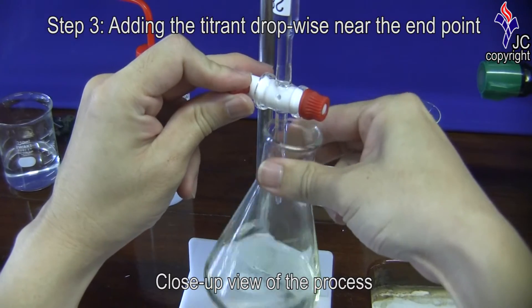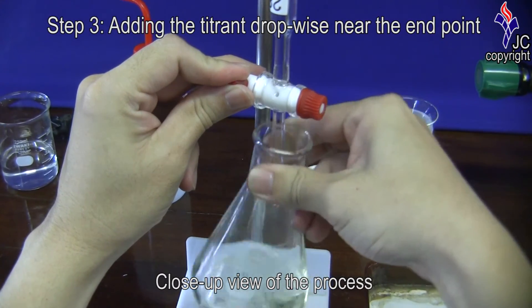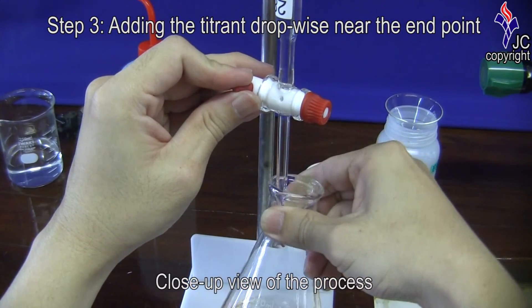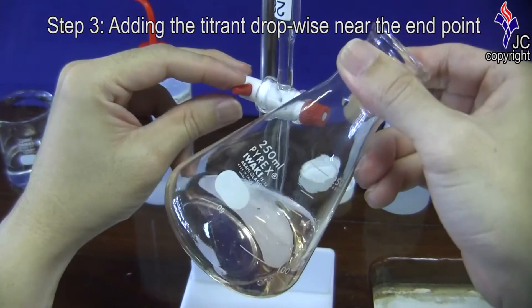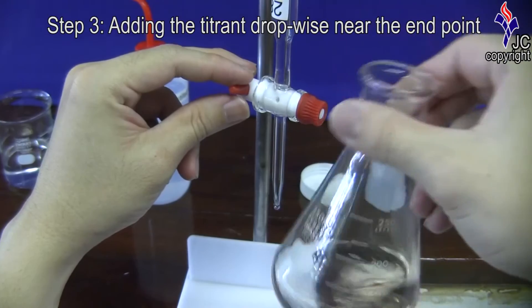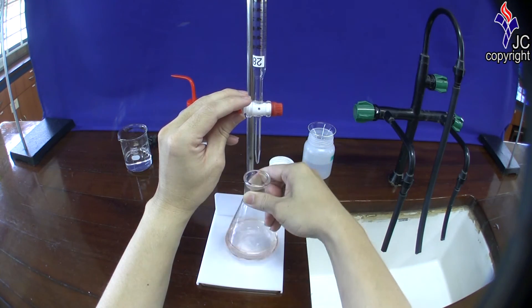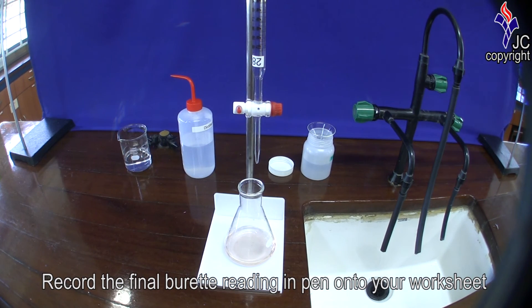This is a close-up view of the process. Record the final burette reading in pen onto your worksheet.